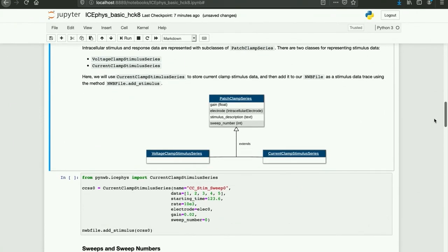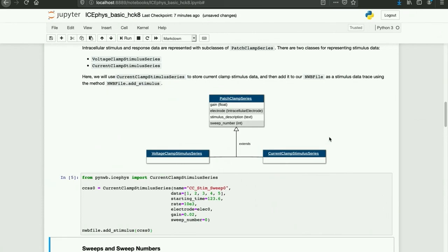There are two classes for representing stimulus data in NWB: voltage clamp stimulus series and current clamp stimulus series. Here we'll use a current clamp stimulus series to store current clamp stimulus data and then add it to our NWB file as a stimulus data trace using the method NWBFile.addStimulus. I also added a sweep number when creating this stimulus object. Sweep numbers are used to group patch clamp series traces that were recorded simultaneously and provide a reference for lookup in a sweep table that is automatically created by PyNWB when the file is written.